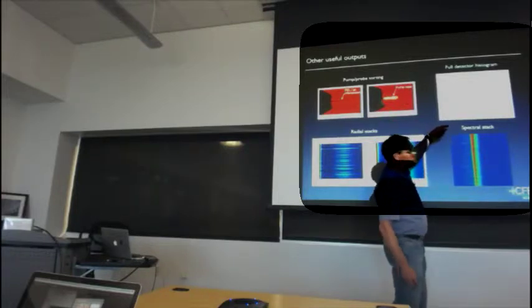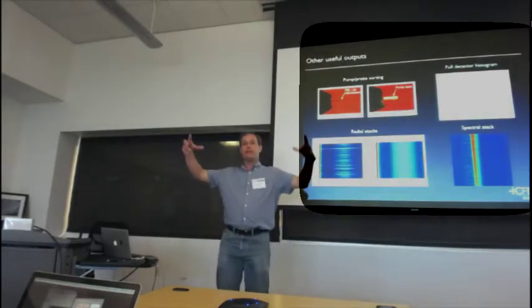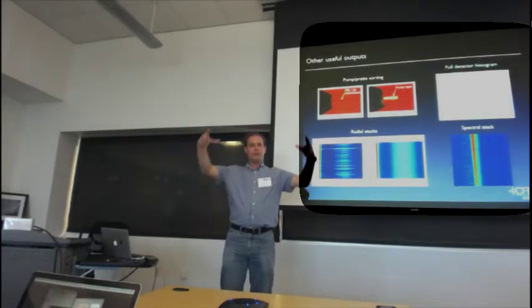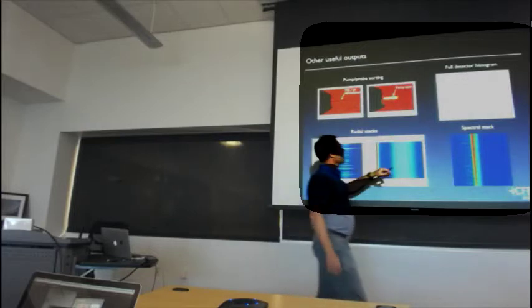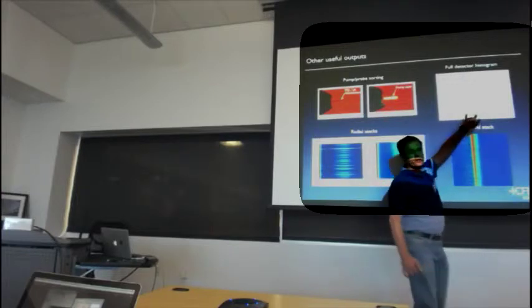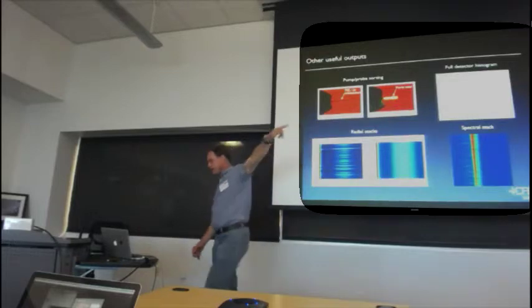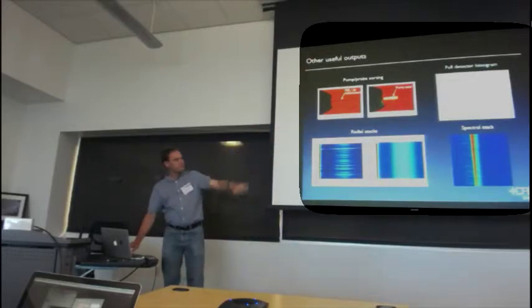And for single particle analysis, you can actually take this detector of 2 million pixels and do a histogram of the values, of the detector values on every shot. So that's a single photon peak from a dark field in a single dark field thing. So that's the dark counts with its natural width, and that's the single photon peak, and the difference between those is the number of ADU per photon, per pixel. So you can actually calculate that value on a per pixel basis.